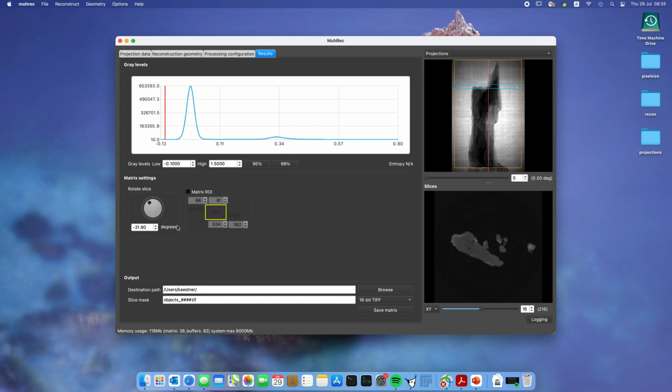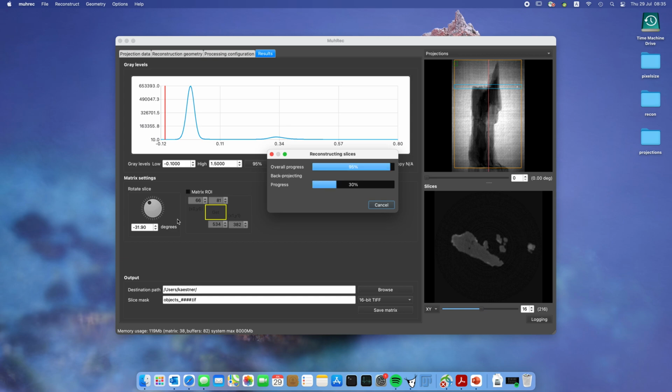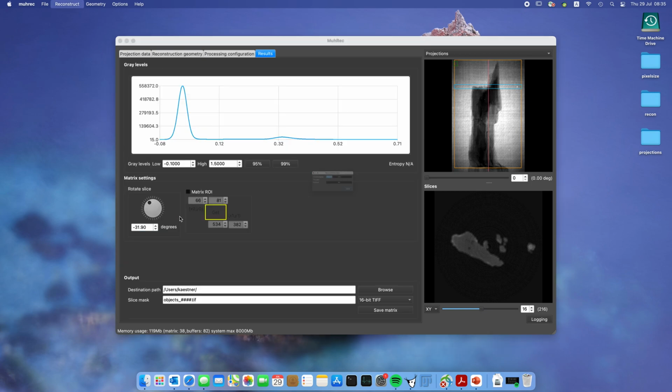And it's pretty sharp already. Now when the sharpness is at this level, it may be difficult to tell if it's going to get sharp or not. So then we have to actually do a little bit of fine tuning. So trying ±1 pixel and reconstruct again. So as you can see, there are a lot of intermediate reconstructions, and this one didn't turn out pretty good. So let's go back again. Maybe we do 79 instead and see what happens. Yeah, actually, I think it's better.